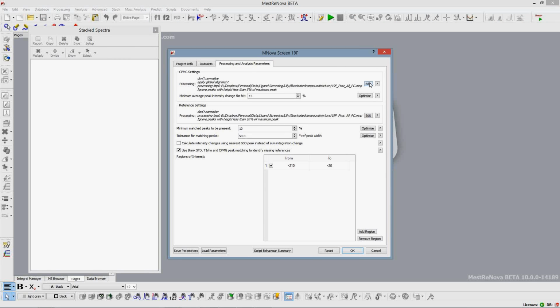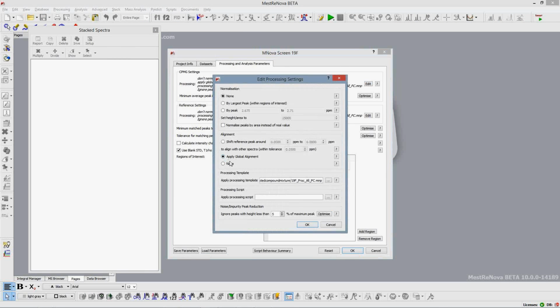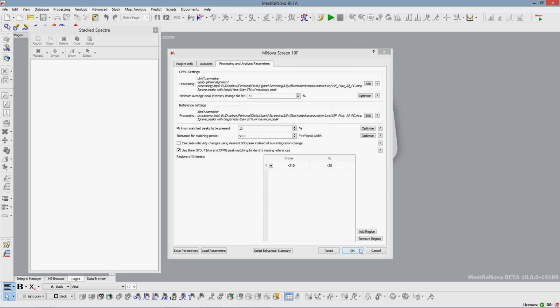And this is that for Fluorine, since on many occasions we didn't have any helpers, any hooks to perform an alignment, we did a lot of testing, and we found out that by using global alignment, we were getting things to the place where we were happy with it. For Fluorine, my recommendation is do give it a shot if you are doing Fluorine campaigns. Play with the global alignment with Fluorine, and tell us what you think.